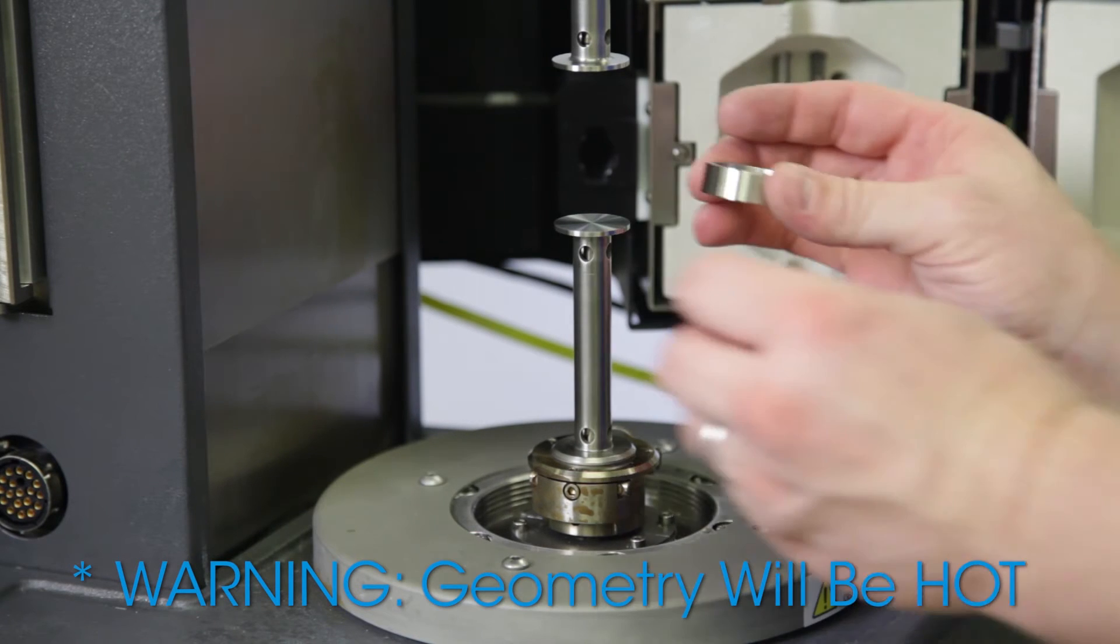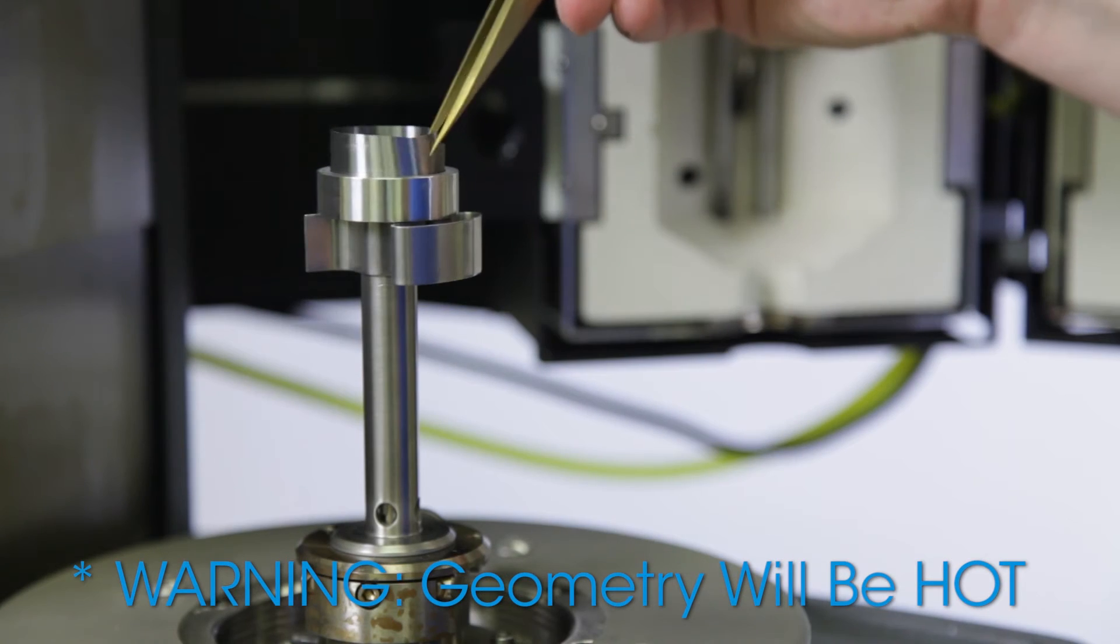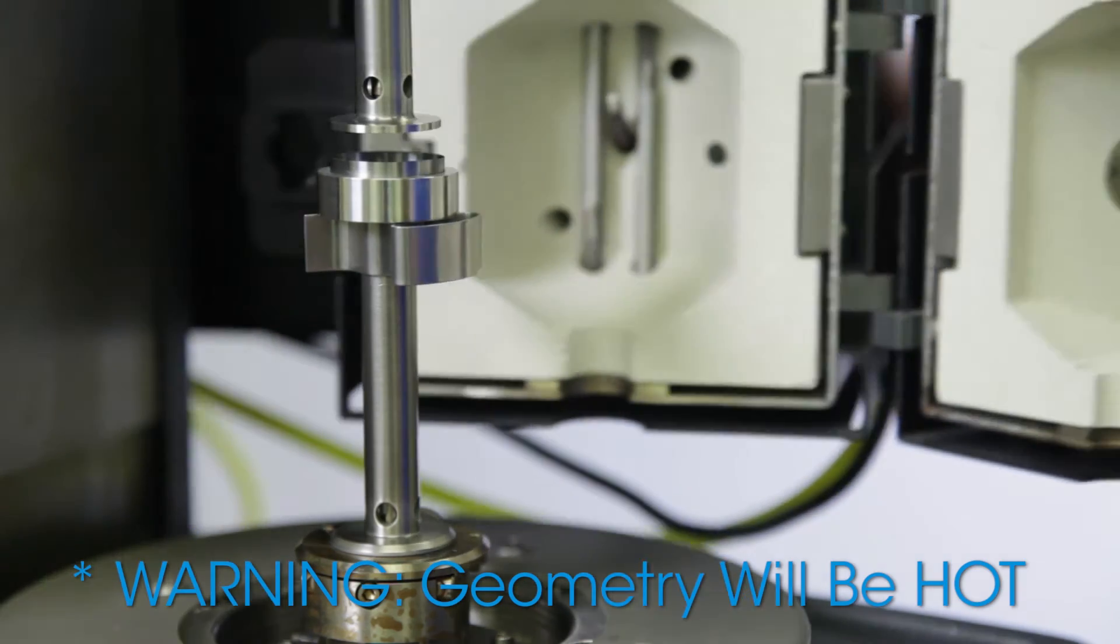When the gap is zeroed at temperature, open the furnace and mount the clip to the lower geometry. Place the ring with the metal shim inserted over the lower geometry. Again, close the furnace for a couple of minutes to allow the ring to heat up.